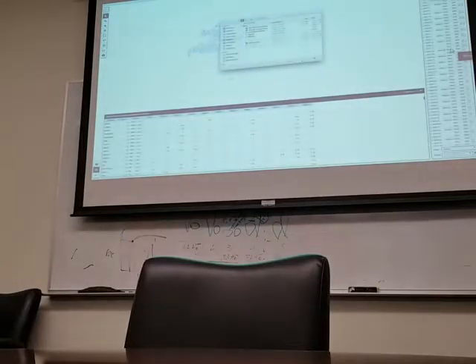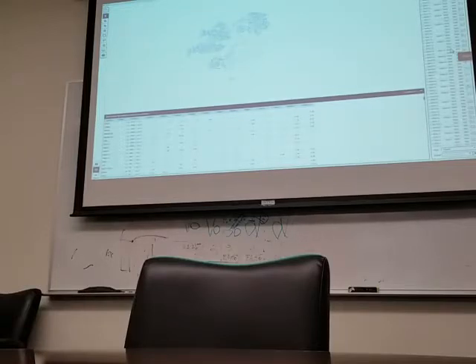It calls clonotypes based on 100% CDR3 similarity. I was going to see whether we could broaden the clonotypes by, say, 85%. Then we would have a clonotype that's defined by VJs and lengths.